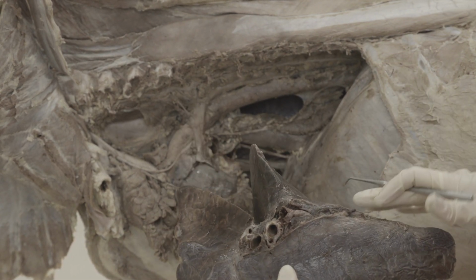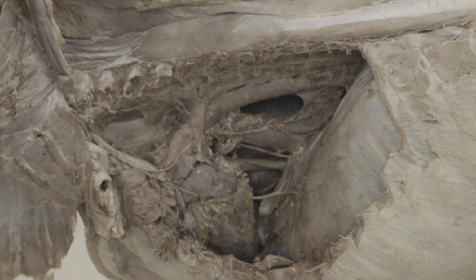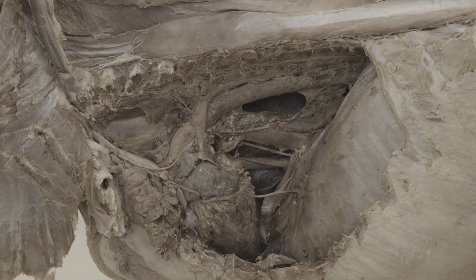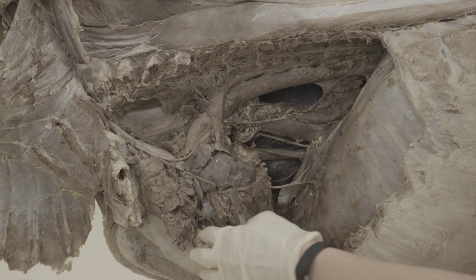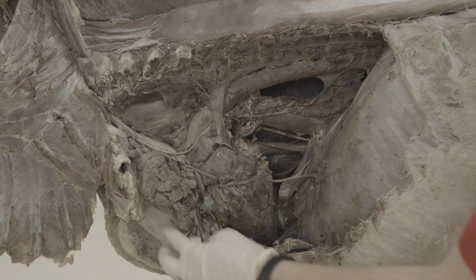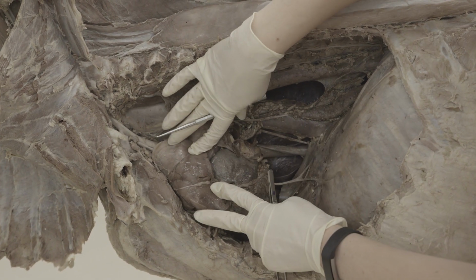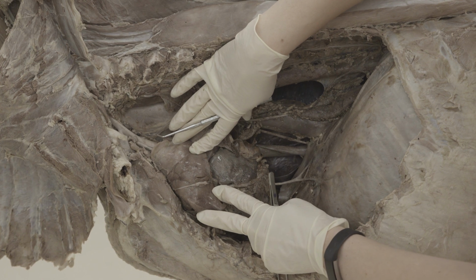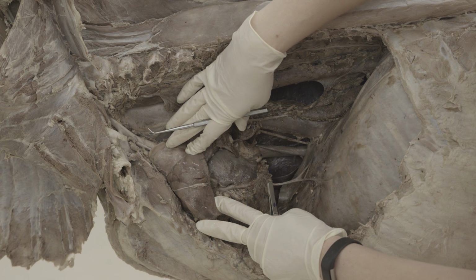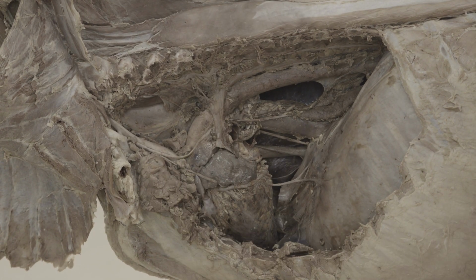So then we'll look at the inside of the chest cavity and start naming some of those structures. So here inside the thorax, in the calf, you'll have a lot of thymus. And so like we saw cervical thymus in the neck, you also have thymus inside the chest cavity here, and it really does get in the way, and you have to work kind of through it to find things. So don't feel bad about tearing apart some of the thymus, because you just have to get to what you need to see. So here we'll start.